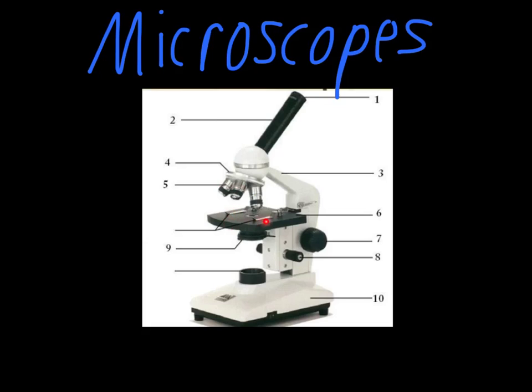The stage is the next part of the microscope. This is where you'll actually put your slide. The clips on either side of the stage allow you to secure your slide.